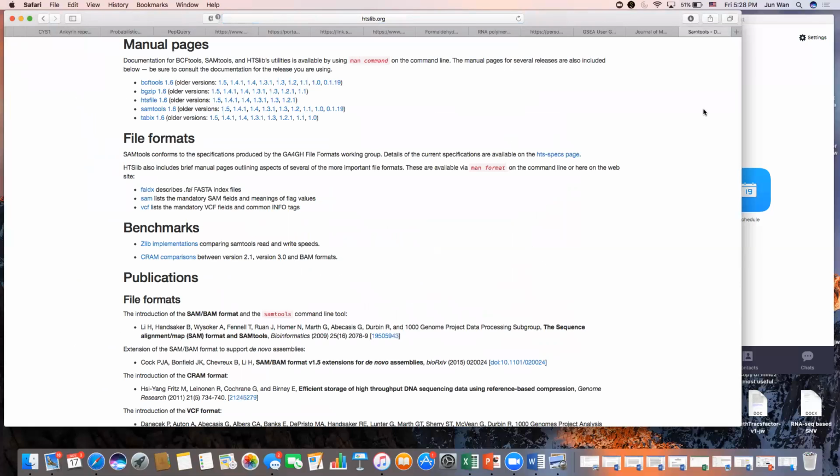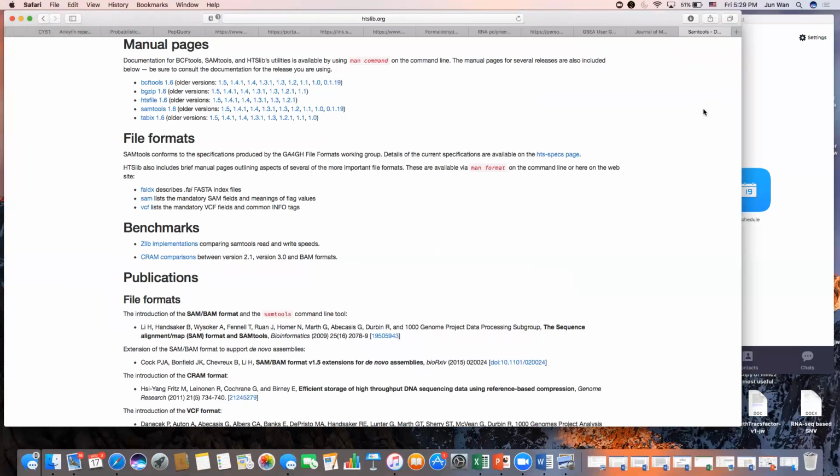This is how straightforward SAM is. Once you've generated your index and made your SAM, you've done the hardest part of all. After this, again, I'm giving you simple default codes. You can get as complicated as you want to get. There are many, many options in each of these packages. I'm going to give you the most direct default statements to generate your peaks.